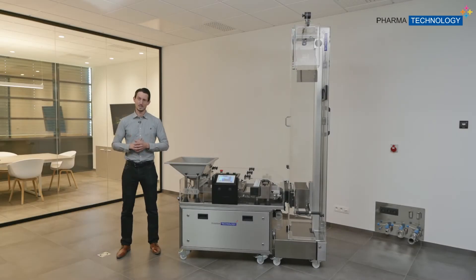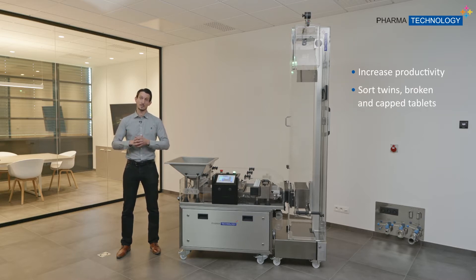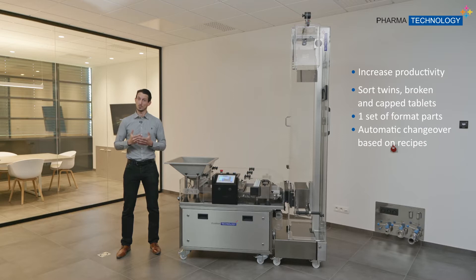The main key benefits of this machine is to improve general productivity in your line. We do that by sorting three different kinds of tablets you don't want: twin tablets, broken tablets, and capped tablets. We also have just one set of format parts, an automated recipe system, very high repeatability of sorting, and it's very easy and fast to clean.